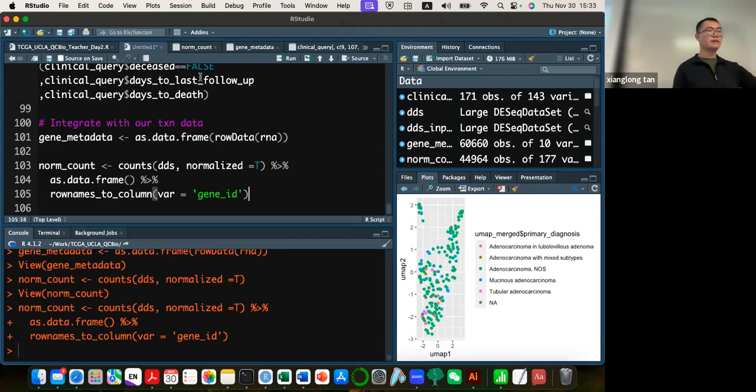Basically, it takes all of the samples together, normalizes sequencing depth and gene counts, and uses a very complicated Gaussian-like formula for the normalization. You can check the manual page, there's a very specific description. Basically, this normalization method in DESeq is widely accepted by peers. It's similar to RPKM, but they claim it's better than normalizing with RPKM.